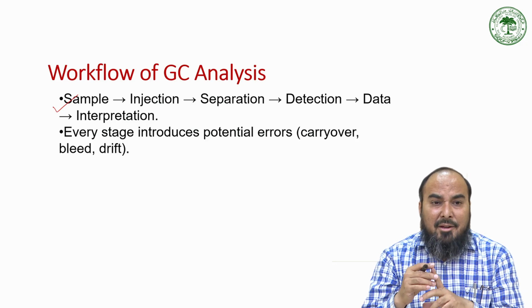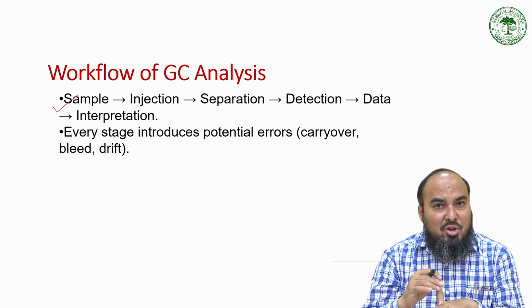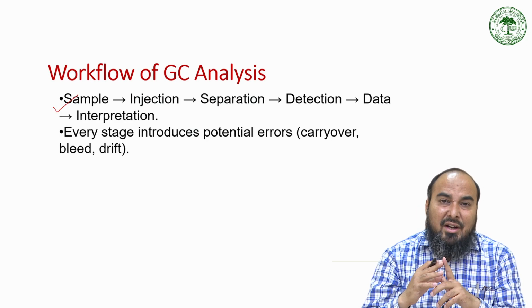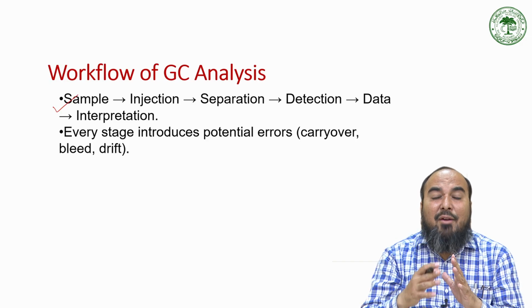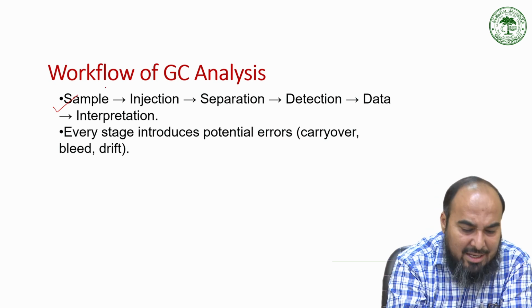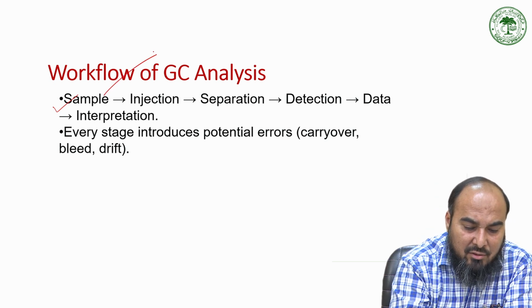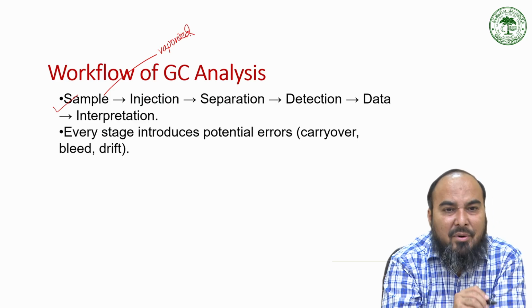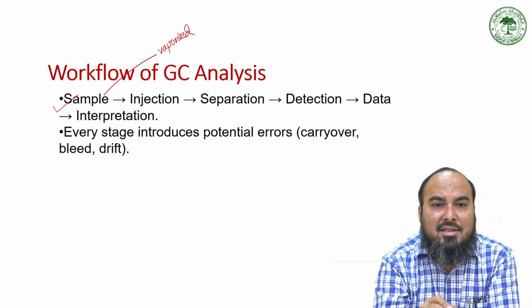So initially you have to check the state of the sample. Your sample must be in the vaporized state. If it is not in the vaporized state, then you have to vaporize it before injection. Your sample must be vaporized. Then you have to inject this sample.